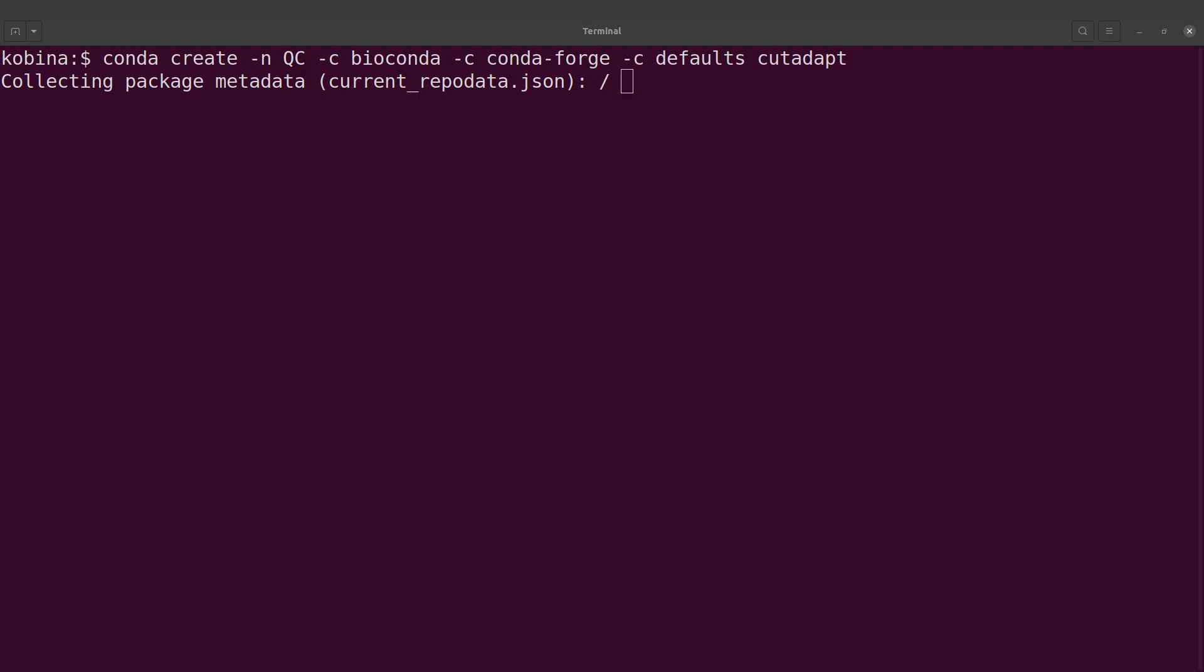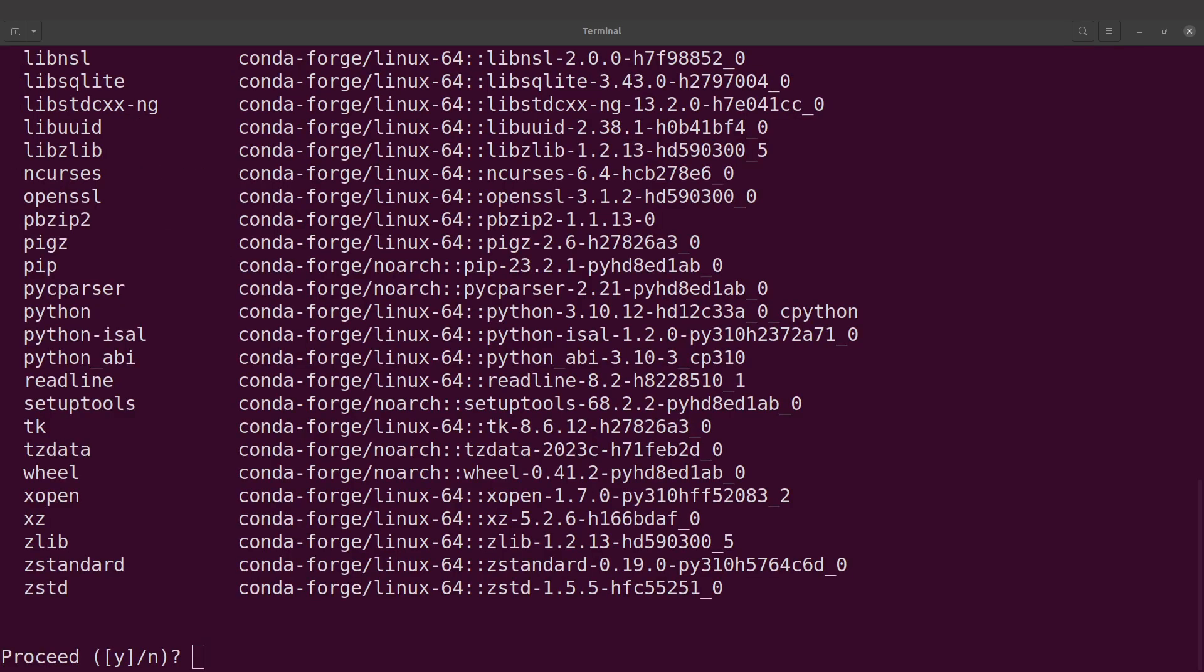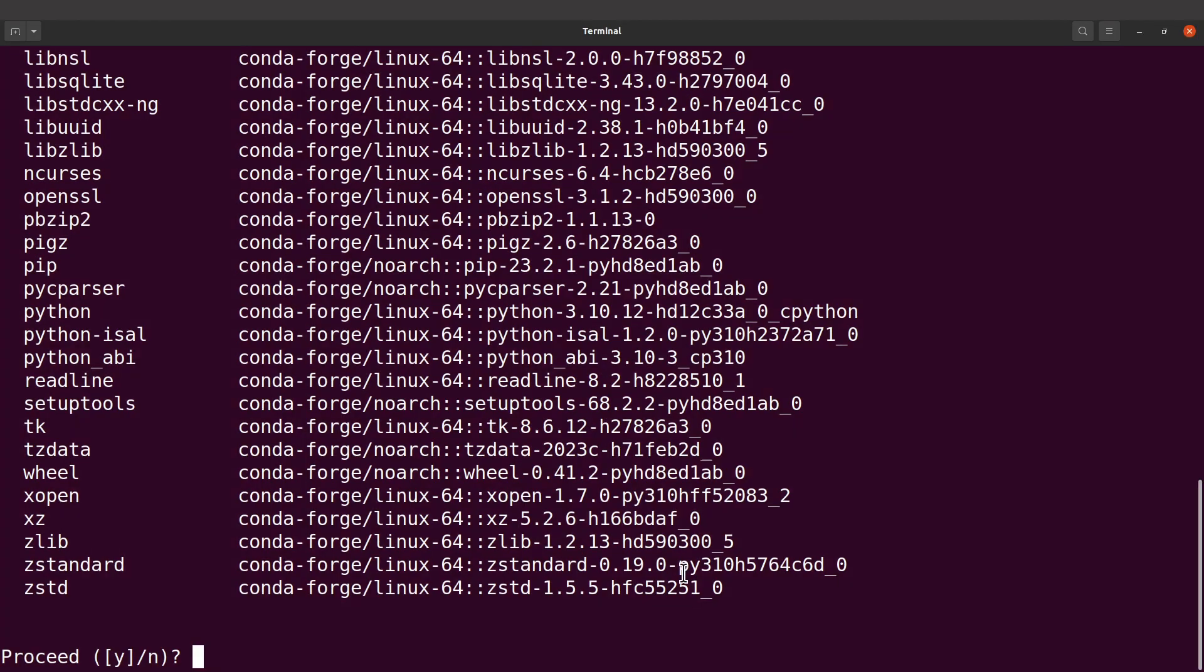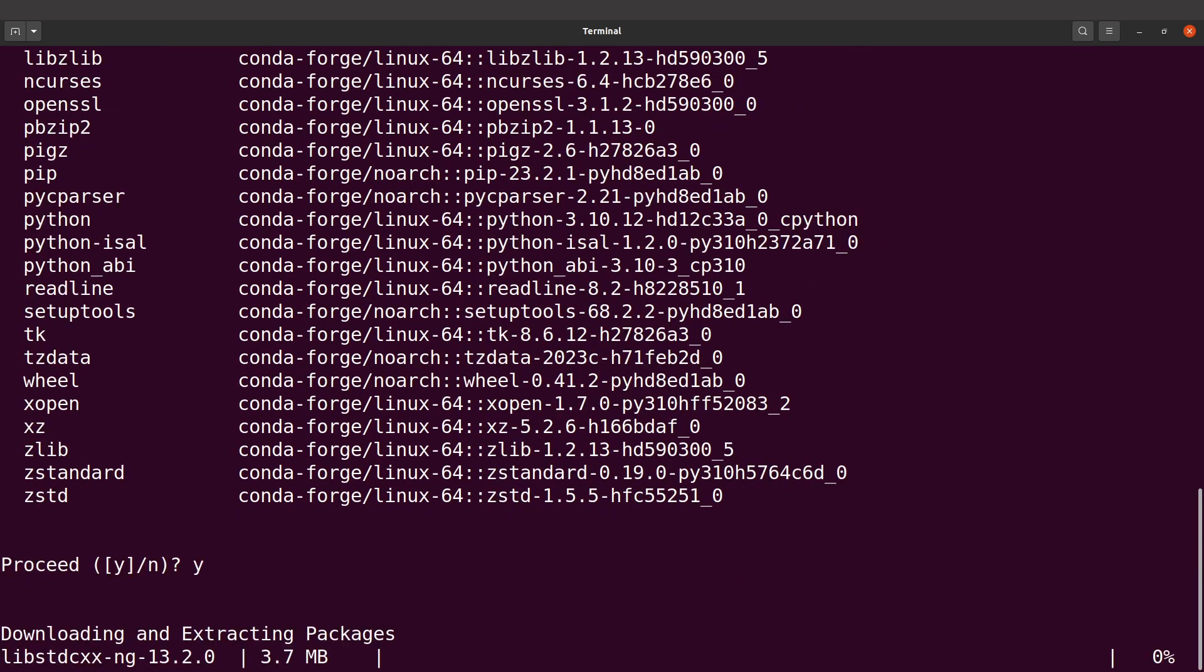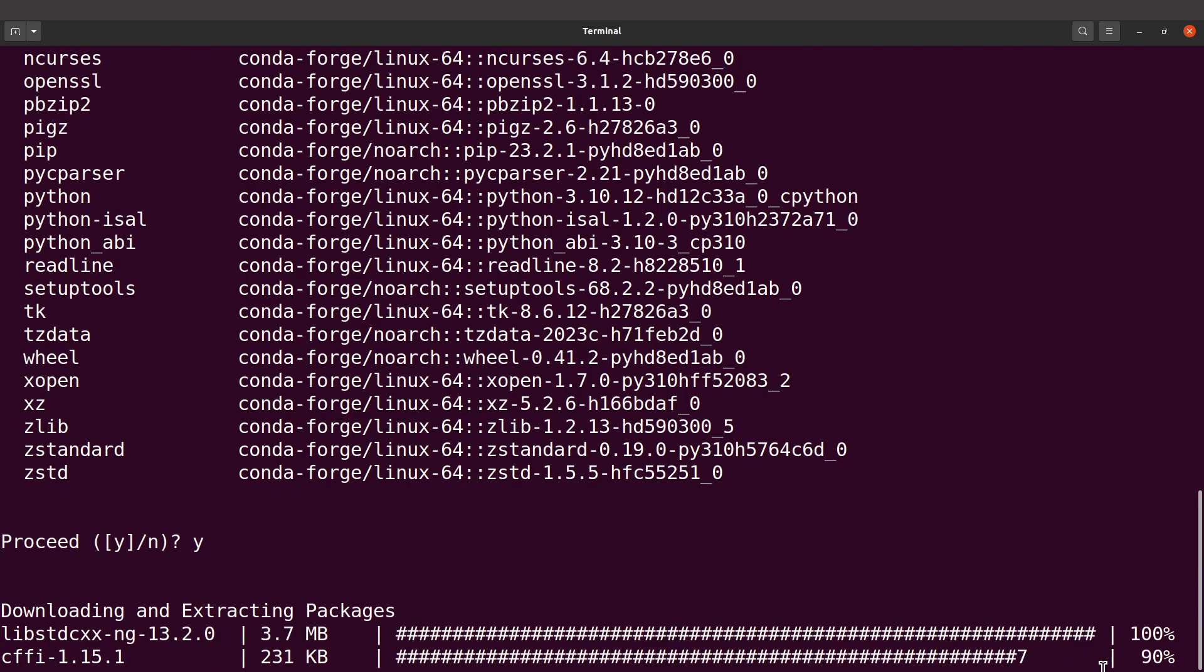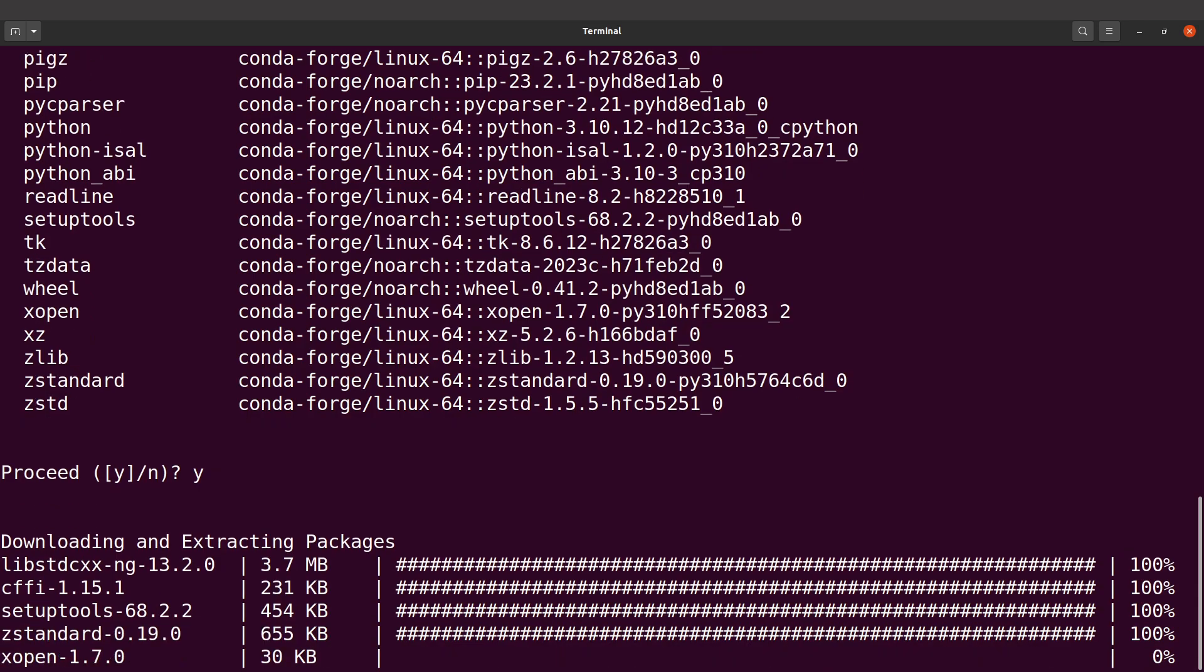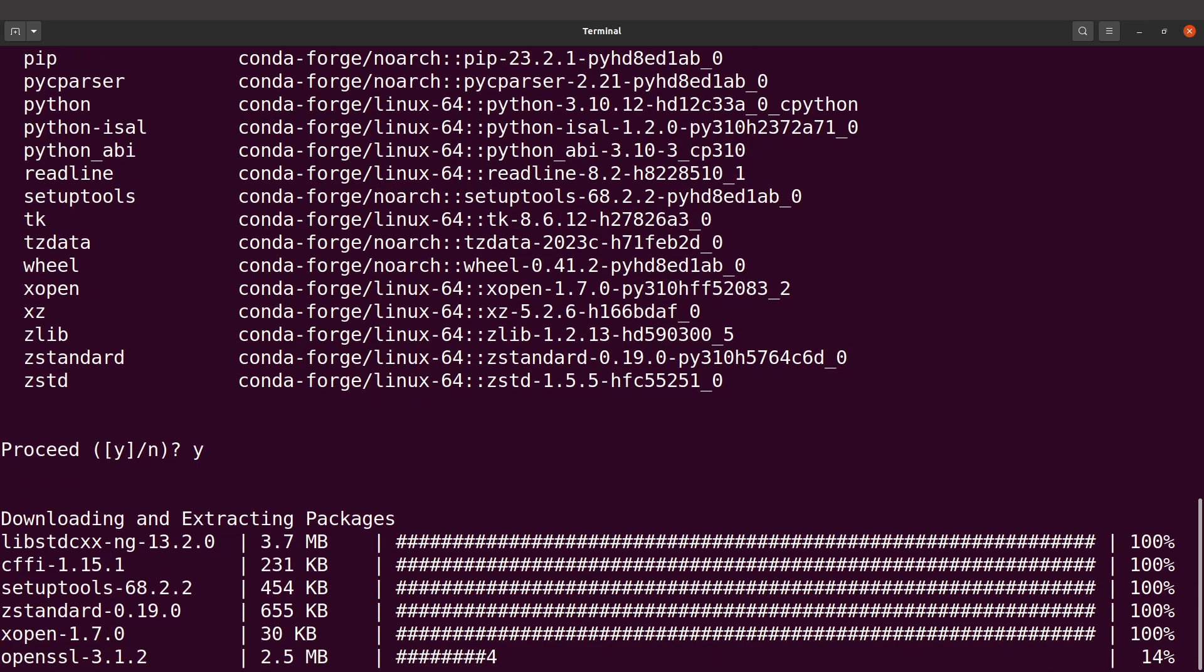Take note that if you use conda, the time it takes to install or to resolve the environment can take some time, but you'll be fine. So let's proceed. I'm going to type Y to confirm, then I will hit the enter button. Conda will download all the accessory packages and store and configure them for me, so I'll have to wait for everything to get done.